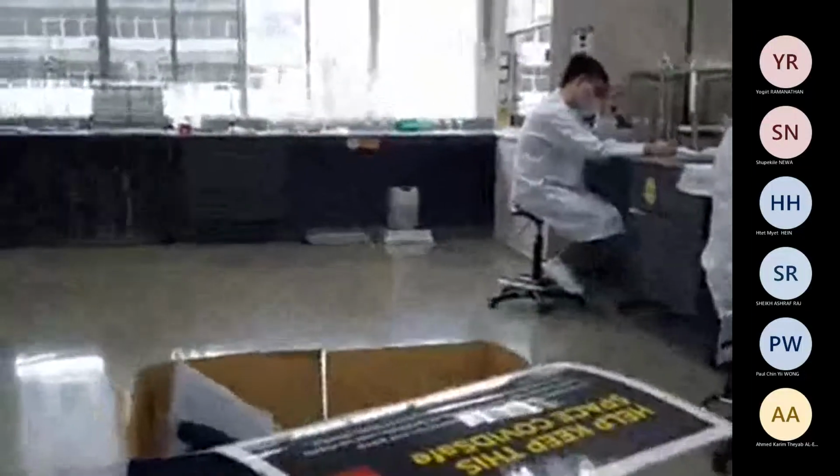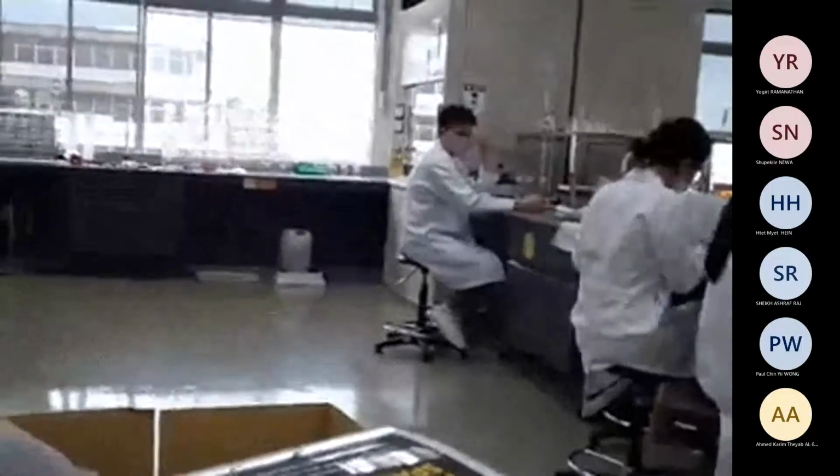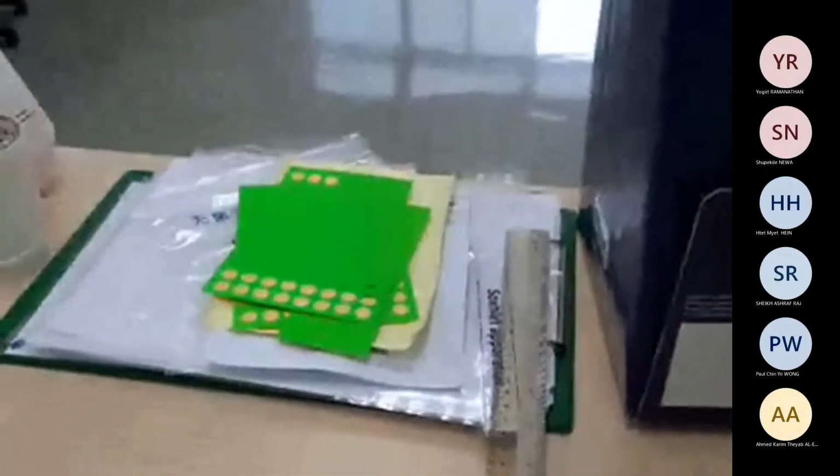Where is the unknown? Do you have unknown on your table? Any unknown solution do you have? It should be probably in fume hood 3 or 4. What is that? We find absorbance. Yes, we will find the absorbance.